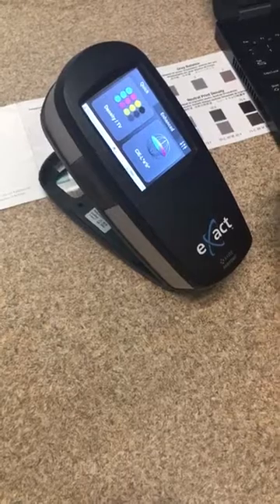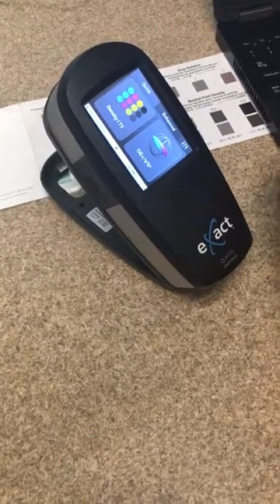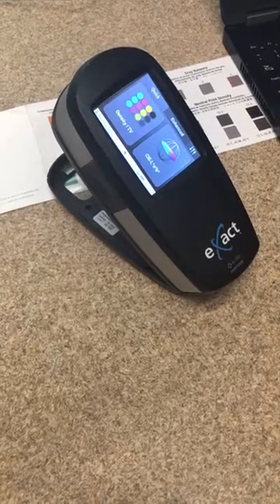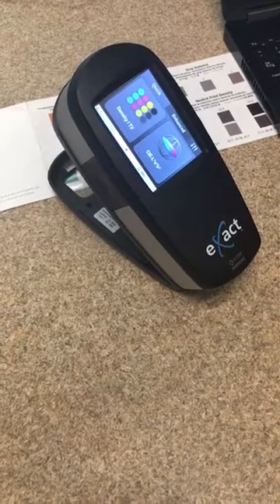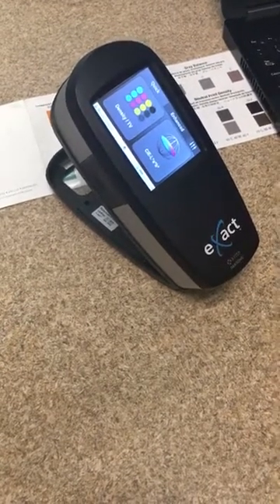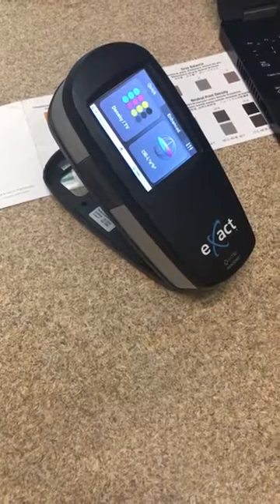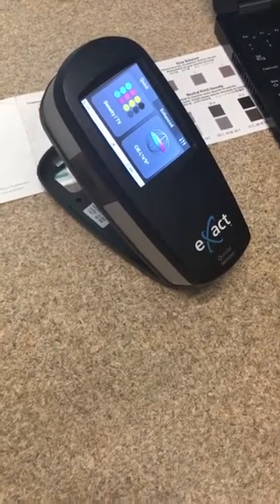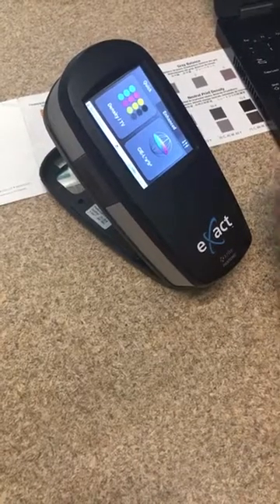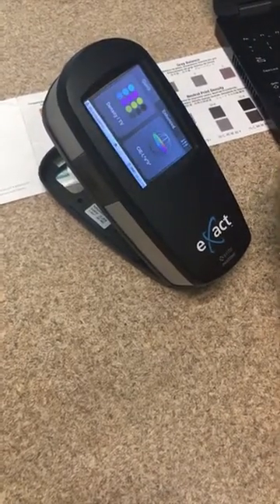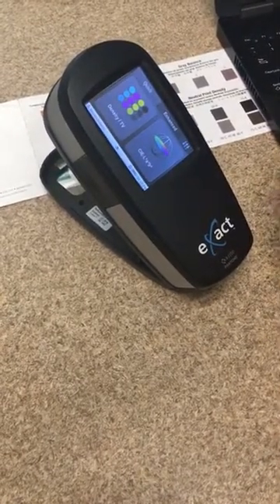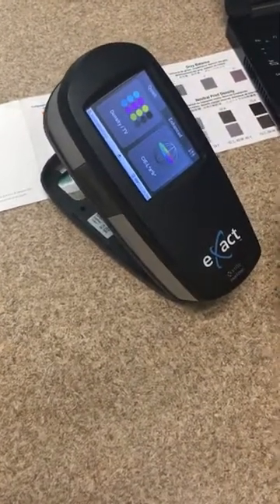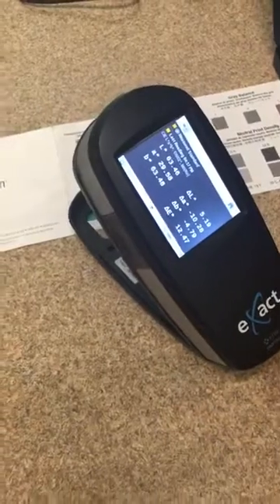That's a really cool feature the Advanced has that the Standard does not. The Standard is generally used in many different places, but the Advanced is used more in the Ink Room. It actually has opacity built in, so calculations for opacity, whiteness, brightness, and other calculations used more in an ink room. There are a few other differences in storage and things like that, but those are the main differences between Standard and Advanced.